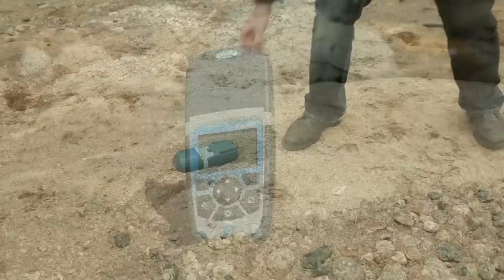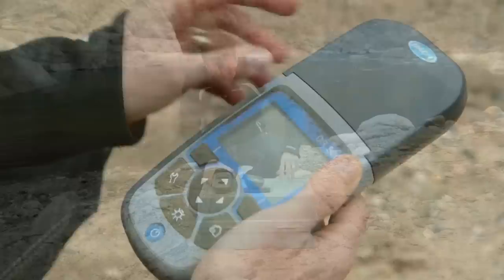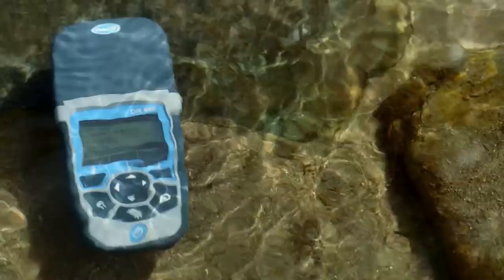It is impossible to avoid the potential grit of everyday testing. You need something that you can pick up, wipe off, and then test with total confidence. Your testing equipment should be waterproof so you don't have to stress about dropping when you are in the field. The DR900 has an IP67 waterproof rating, so you have nothing to worry about. The DR900 makes water testing in harsh field environments a little less challenging.